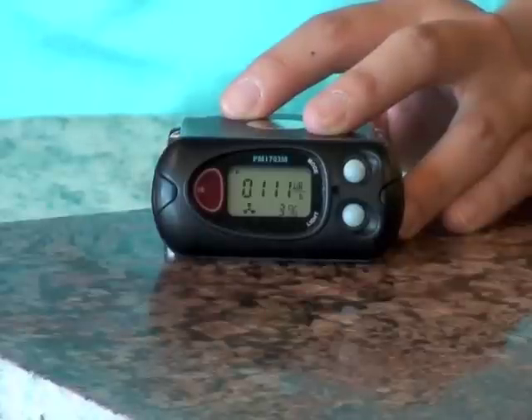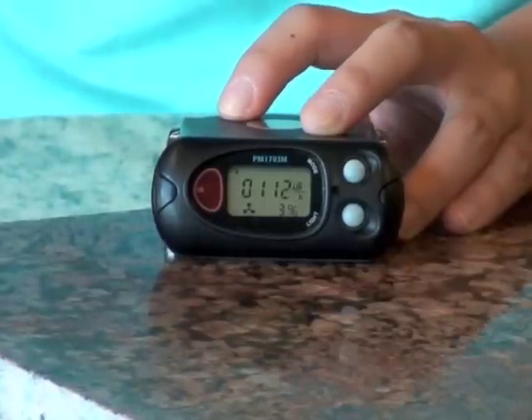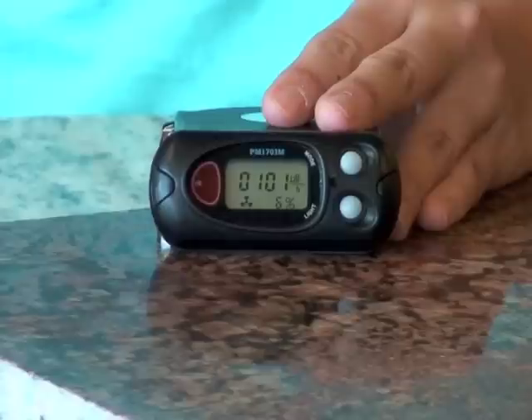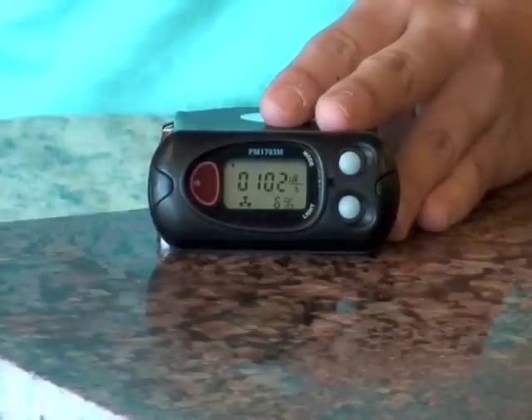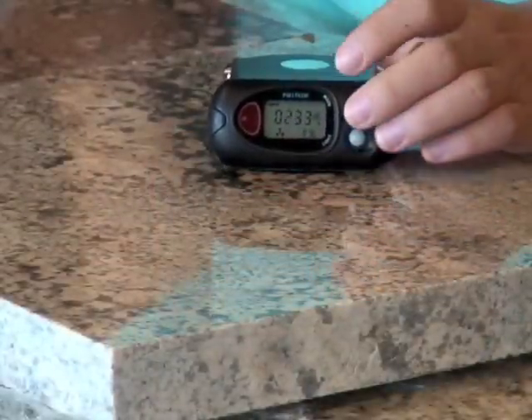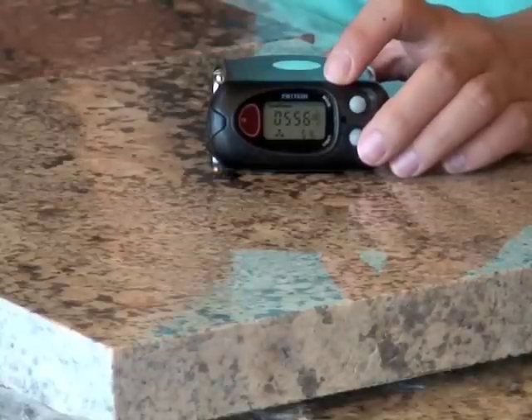We've tested this exact spot on this stone for radon, and it's putting out about 10 picocuries of radon per square foot per minute. That's considered a moderately high level of radon emanation, but it's not enough to raise the levels of radon in your home. However, if you find a hot spot that is as hot as this one, reading in the 500 range, you may want to consider having the granite repaired.